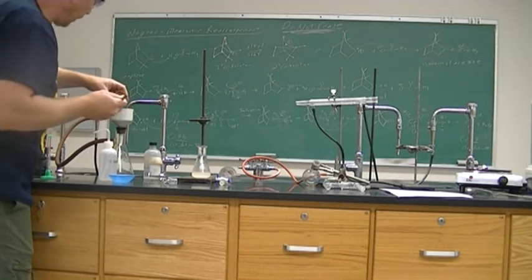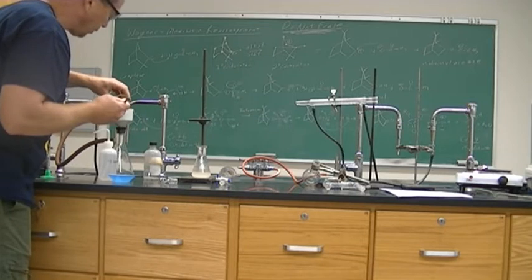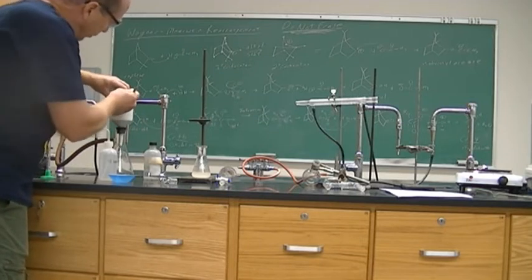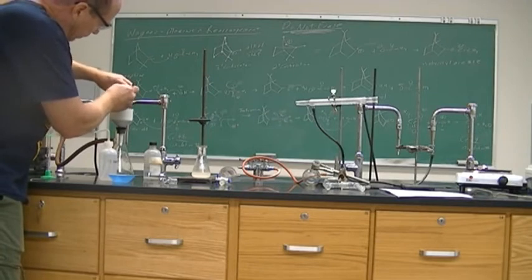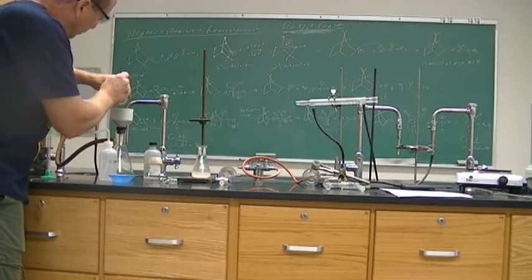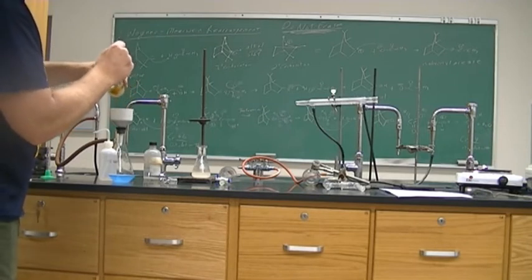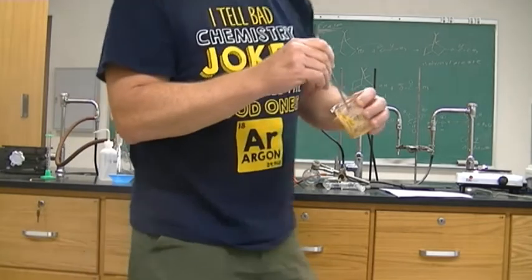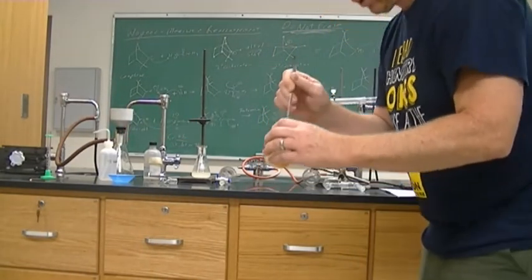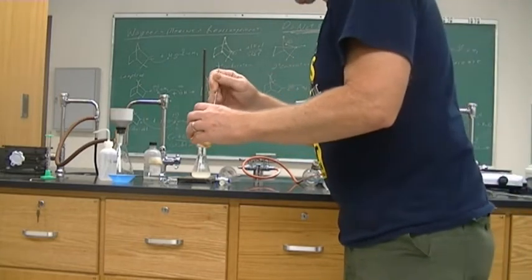Pulling the vacuum, you can see the solid, some of them, well, those are bubbles, but the liquid is going through pretty quick, so it's a good suction filtration, not just gravity pulling it through. And then we have our chunk of solid. I don't know if you can see this chunk of solid that's about to come out of here, along with the ice cube. Trying to keep the ice cube in there. I don't want to collect the ice cube. I'm a little concerned that this oil is going to stick to our filter paper. We're not going to be able to get it out.